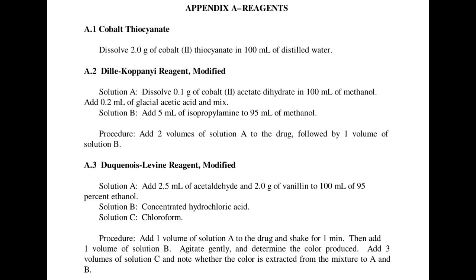So in other words, very mildly acidic, very mildly. The second is made by adding 5 mils of isopropylamine to 95 mils of methanol. And interestingly, you can buy isopropylamine and it's not all that expensive. I was surprised by that.